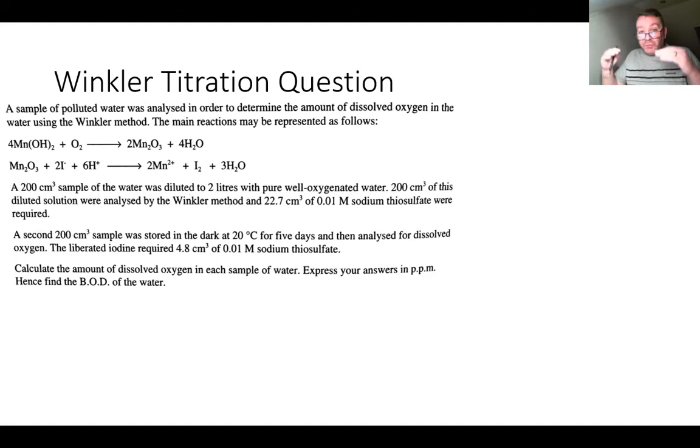Both of them will give you a level of oxygen, and depending on what the discrepancy is between the two, the smaller the discrepancy, less demand, less pollution. Greater discrepancy, greater demand for oxygen, greater pollution. That's the link between the two.